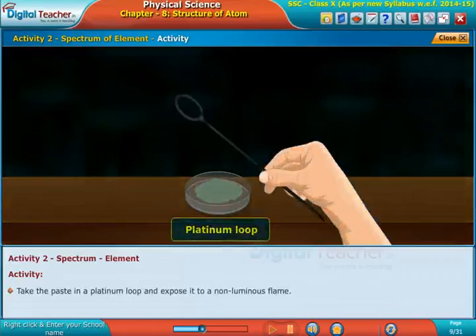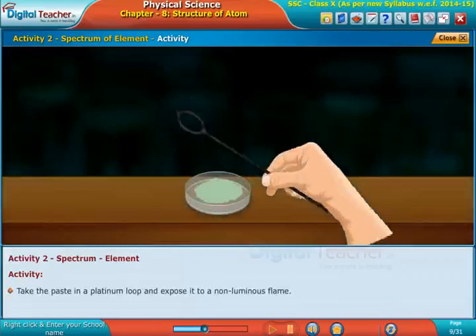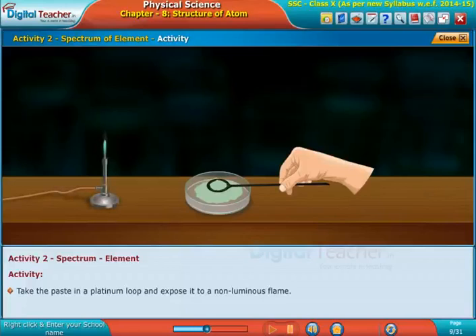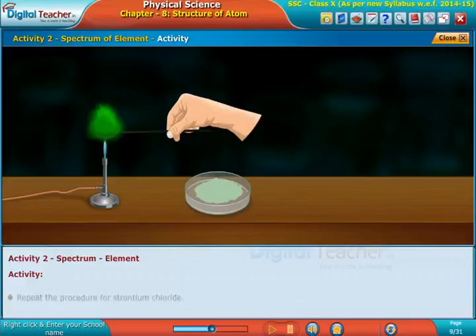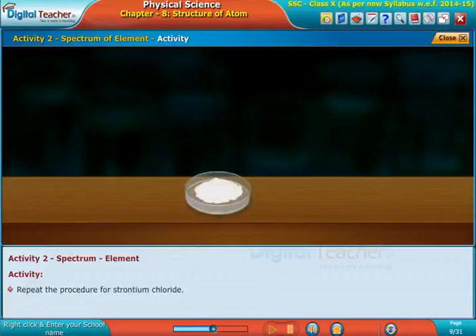in a platinum loop and expose it to a non-luminous flame. Repeat the process for strontium chloride.